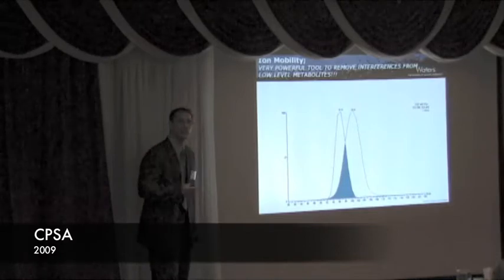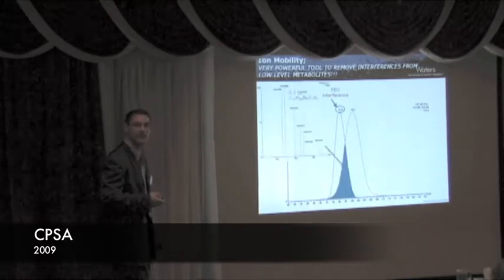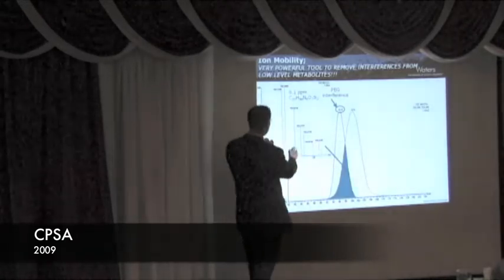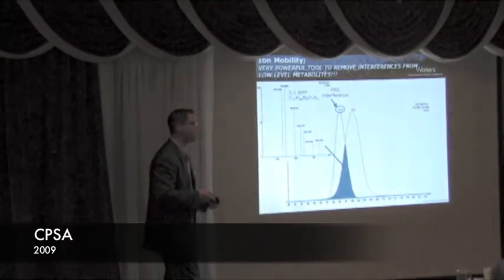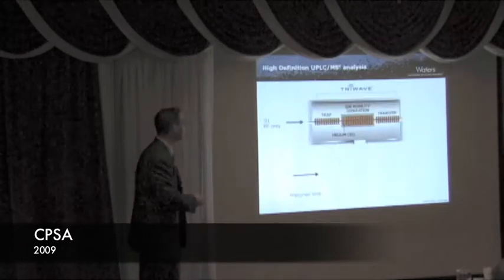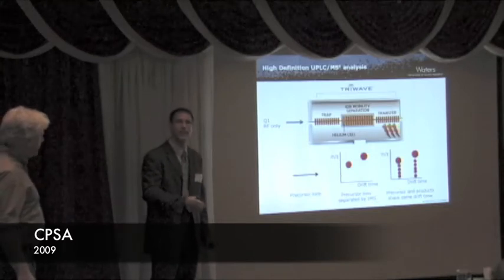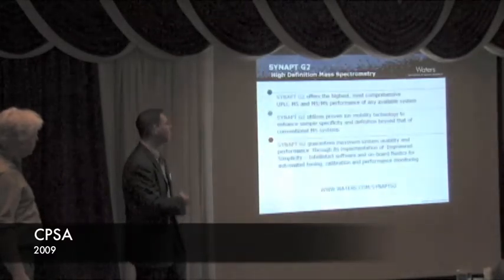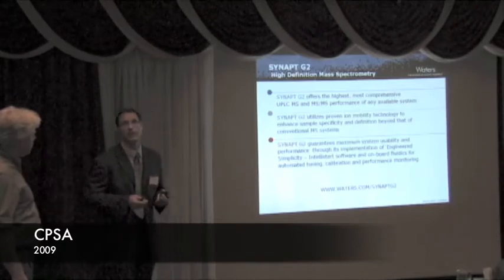So now you ask, what about that? Well, let's say we have two components in one of our analyses after the hydrophobic separation and high-res mass measurement, okay? We can see our two components co-eluting at the same moment in time. And what happens is we can't pre-select them with our MS selection device. So if this is an unknown compound, how can we get a pure product ion spectrum? Well, we can simply extract them using the ion mobility and fragment them after the ion mobility separation. So we can get all the products of all the precursors all the time with the mobility experiment at the same time. So we're getting increased sample definition. Basically, we get ultra performance in MS and MS/MS mode with a novel orthogonal separation that you can't get elsewhere.